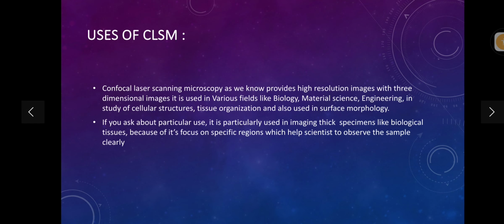And what are the uses of this confocal laser scanning microscopy? It is used in various fields like biology, material science, engineering, study of cellular structures, tissue organizations, surface morphology, many fields.